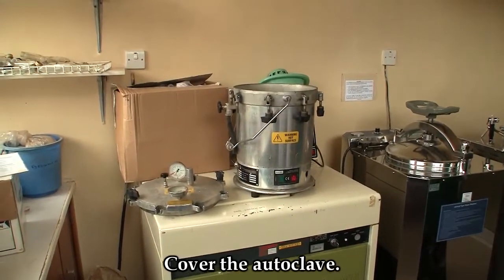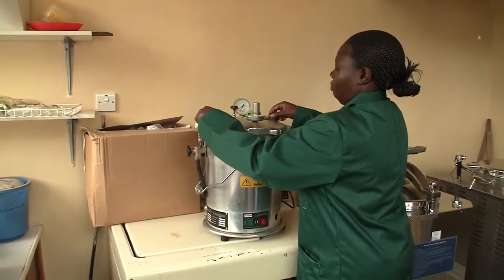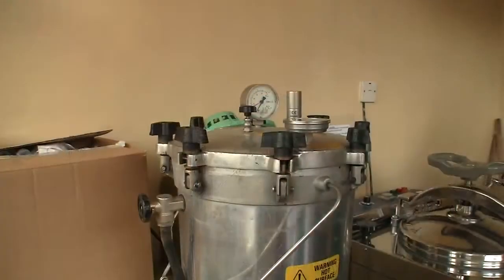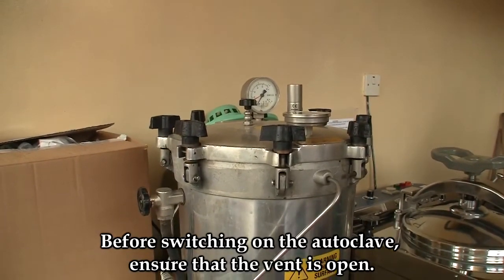Cover the autoclave and secure tightly. Before powering the autoclave, ensure the vent is open.